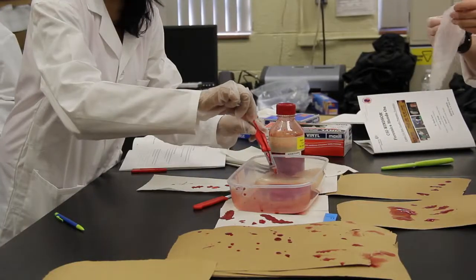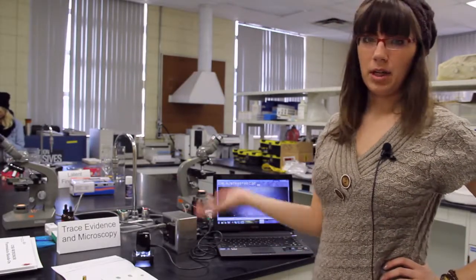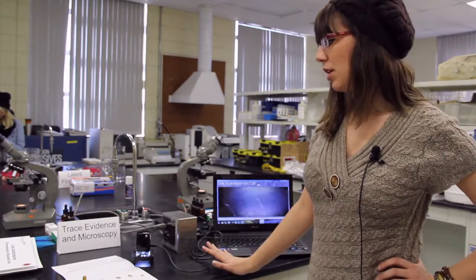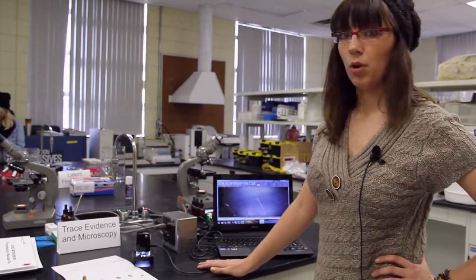We're just using some sheep's blood and making different patterns, whether it's drip or whether it's like spurted like from the body, like lungs. In forensics, anything that's basically small evidence, could be dust, whatever, is referred to as trace evidence. And for this station, we're focused on hair and identifying its origin.